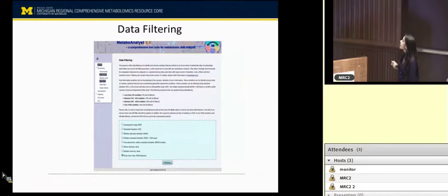Before you go for any further analysis, as Jeff mentioned, you want to make sure of your important features, and you don't want additional things or artifacts. Gary Patty also talked about these things. This is the interface where you can filter out your data, and I'm going to talk more about this tomorrow. These are some different ways, but I'm just going to show you how you can filter the data based on your pool samples or your test pool samples. We'll look at that example tomorrow. So I'm just going to select none here and process this data.